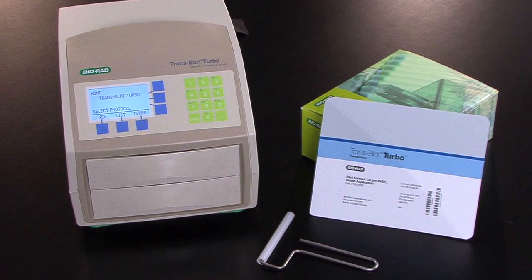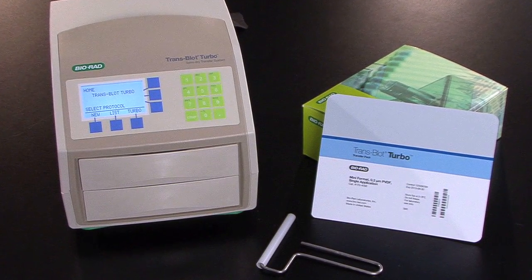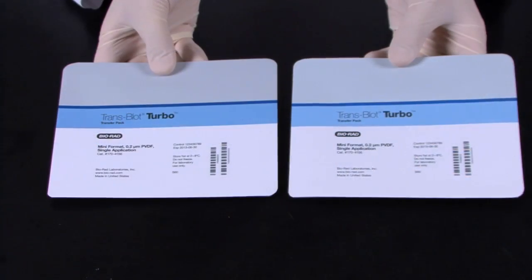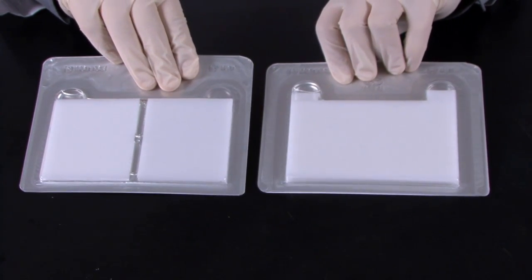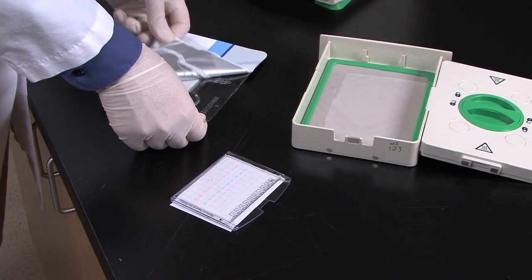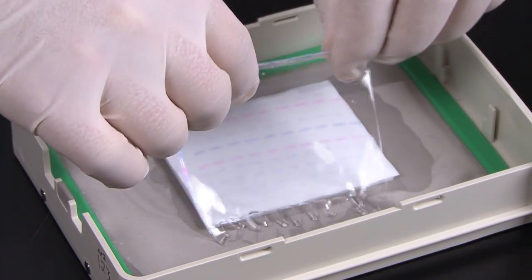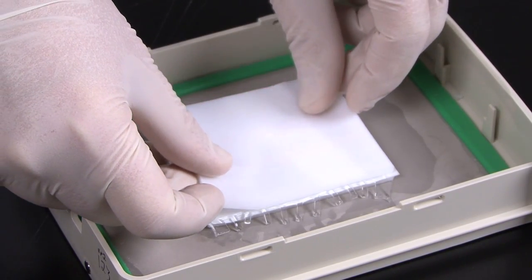With the Trans-Blot Turbo system, these time-consuming and frustrating steps are no longer necessary. Your gel is ready for transfer immediately after electrophoresis, and all the components in a Turbo transfer pack are pre-cut and pre-saturated with buffer and ready to use. All you need to do is peel open the top foil and assemble your sandwich in the transfer cassette.